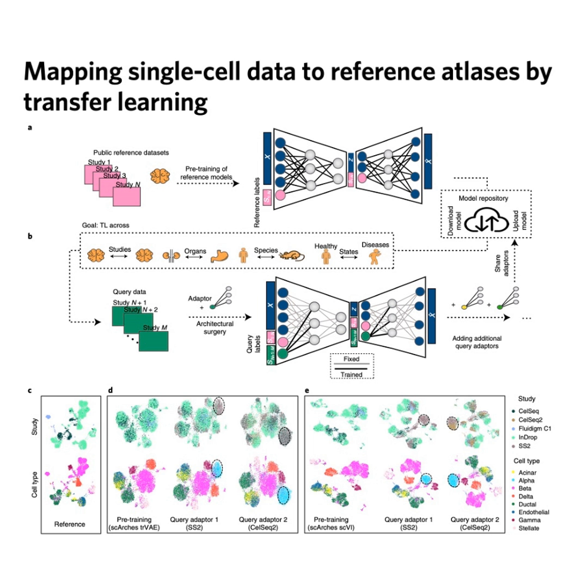So quick recap then. We have these giant siloed cell atlases. The solution, scArches, uses this idea of transfer learning. It takes a pre-trained reference model, freezes most of it, and then trains just a tiny set of adapters to quickly map in new data. And the efficiency gain is just massive.